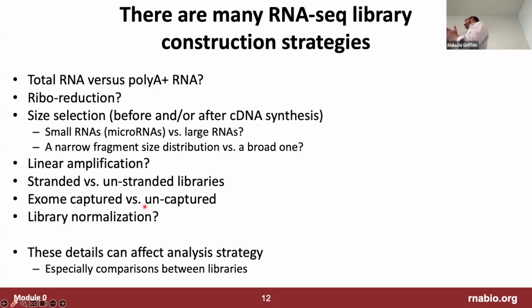So that is often a justification that people will use to say, I'm going to use this approach. If you're comparing data where there was the cDNA capture to ones where it wasn't, then that's where you would definitely worry about that problem, that they're not on an even playing field. Yeah. Thank you.